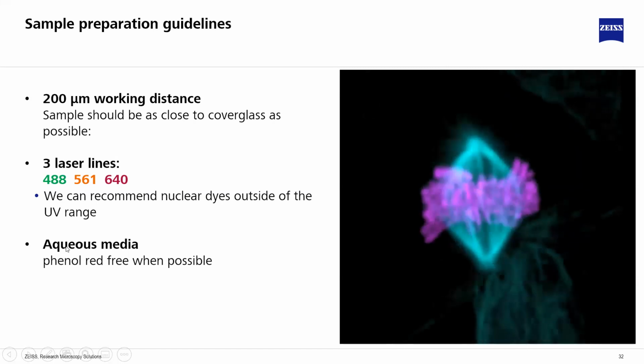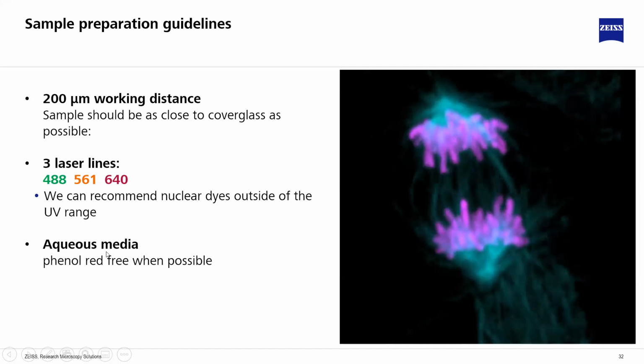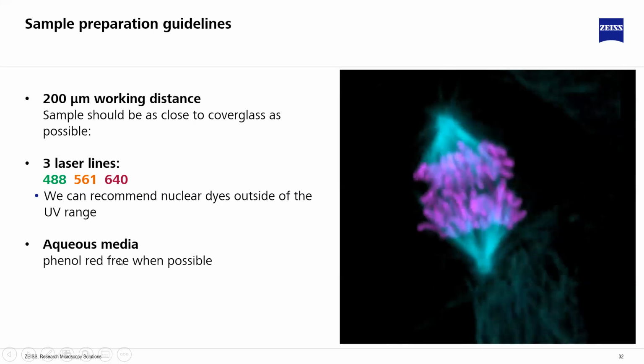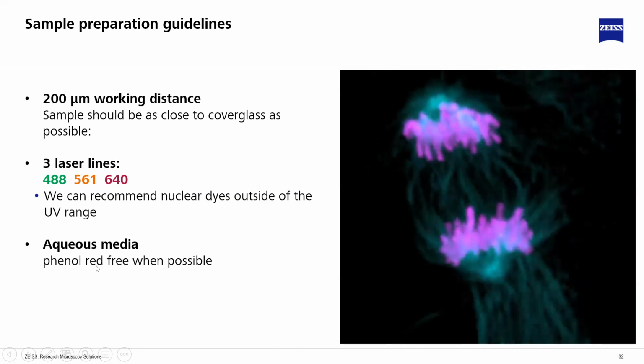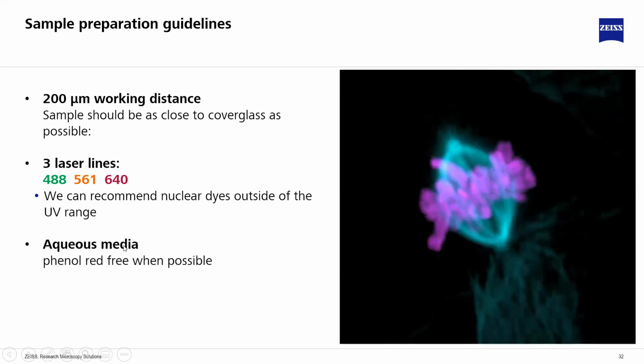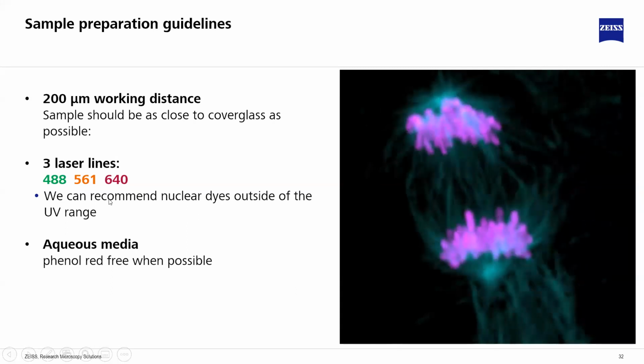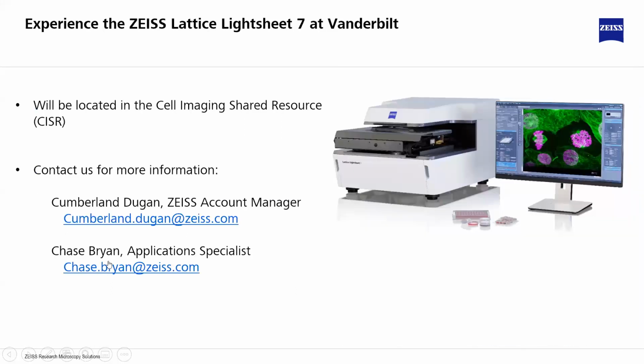And then finally, the aqueous media is really the best fit for this system because it's a water immersion system. And we prefer phenol red free media when possible to try and minimize any kind of background or autofluorescence, if you can. How is this handled?